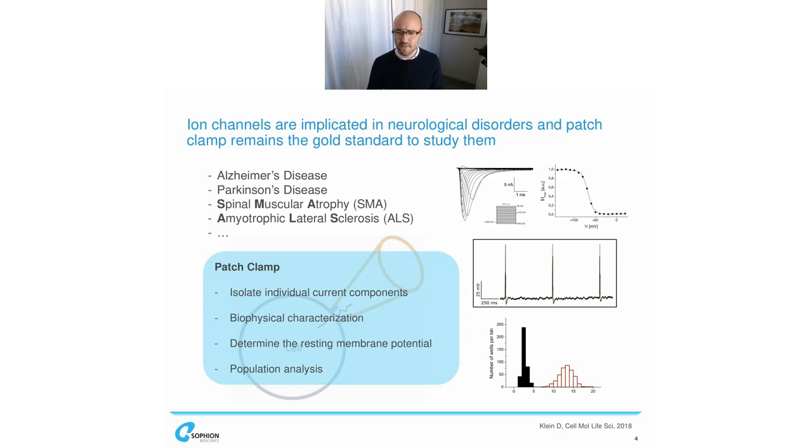Importantly also, it's possible to use the technology for a biophysical characterization, as it's shown over here on the right top side. I don't think actually you see my cursor.